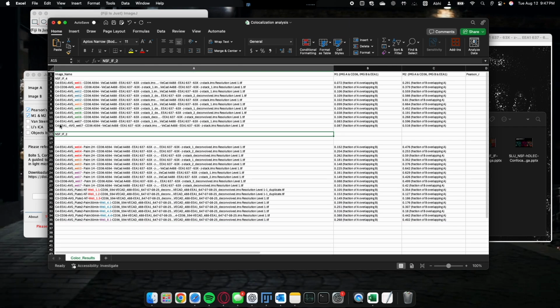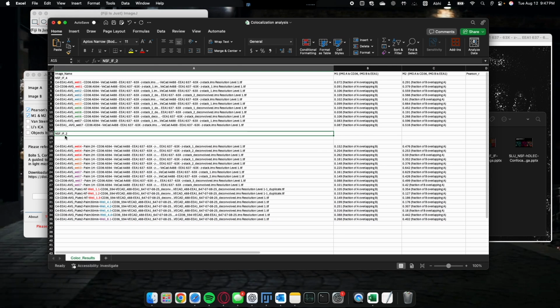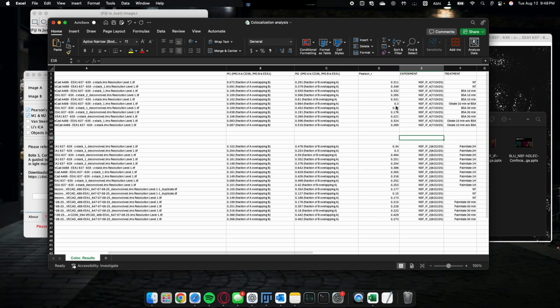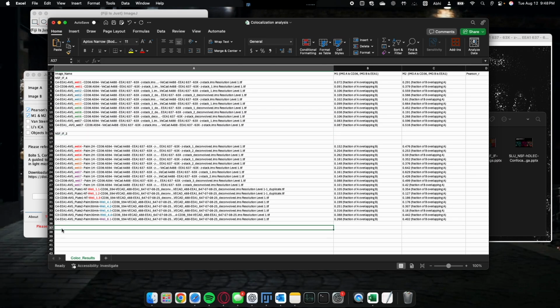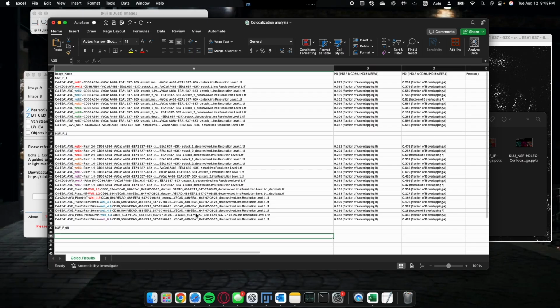If you do increase the space, for example, like I added the tag IF2 here because I wanted to distinguish these two treatments, you only have to add the rows and then add text. So for example, if I wanted to do NSF IF65, just because. Once you add this text, it will auto calibrate and start adding new data where it should be.